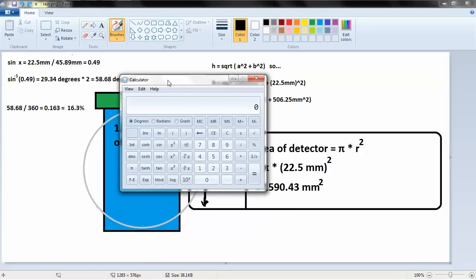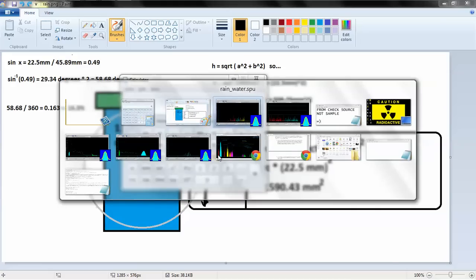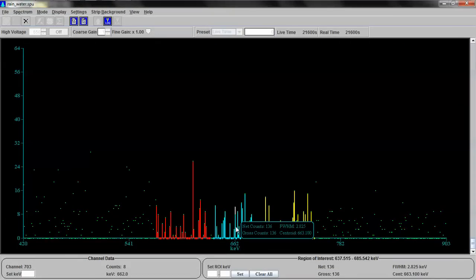Okay, now we know my detector has an energy efficiency of about 5.8% for this energy, 662.66. 5.8%, right? Well, just trust me on that. I figured it out last time I did calculations using my sample sources. And we know I did a 21,600 second analysis. And let's see what we concluded here. I still say that this is way too high. I mean, this is over the top too high, because I would call the sample null. It's too low to be a confirmed detection, but it's too high for me to say that's nothing. I think it's probably some in here, but I think it's too low to quantify. But we're going to quantify it just for giggles to show you how I would calculate it.